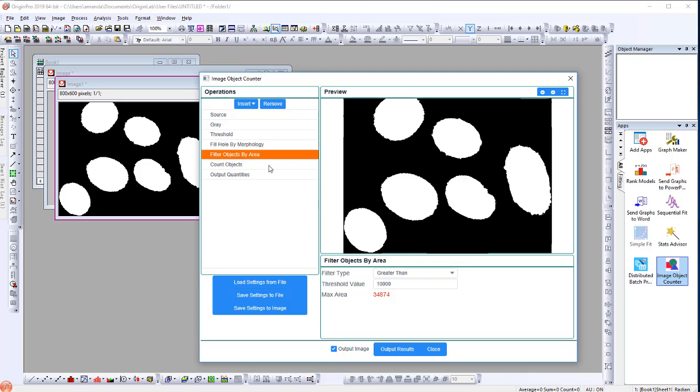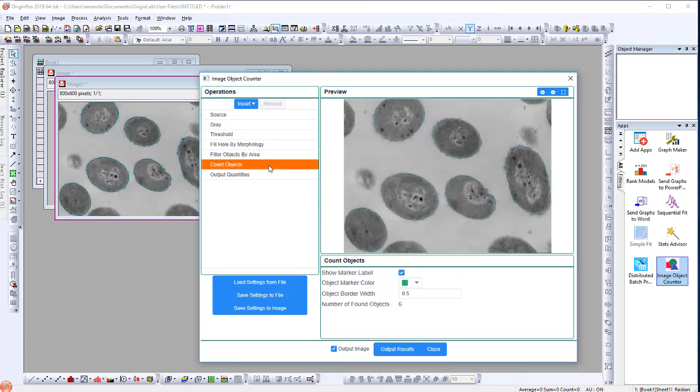Now, select Count Objects. The number of found objects shows 6.